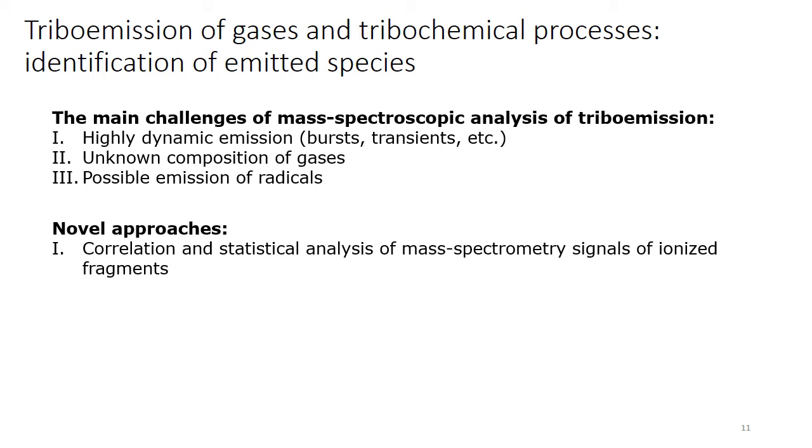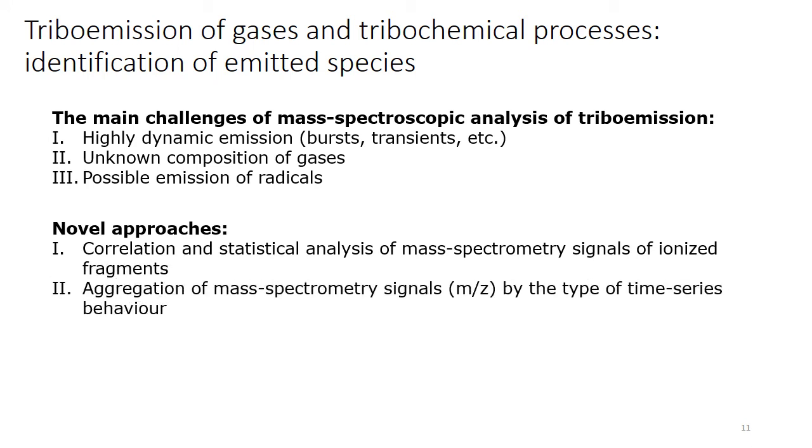Our advancement in this field was to develop new approaches which consist in developing a procedure for correlation and statistical analysis of mass spectrometry signals of all ionized fragments, and aggregation of mass spectrometry signals by the type of time series behavior.